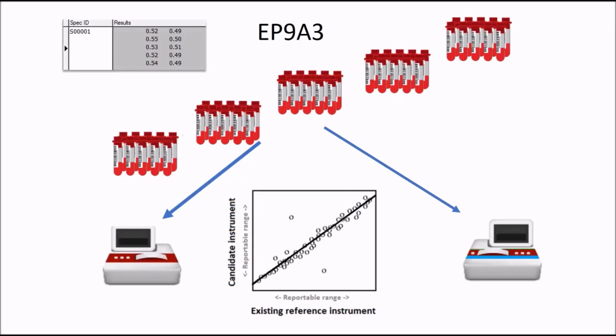It also allows the user to identify outliers more easily and to exclude any data that may be problematic where appropriate. This granularity helps produce a high-quality dataset and basic experiment ready for advanced statistical analysis, which will be described in the second section of this video.